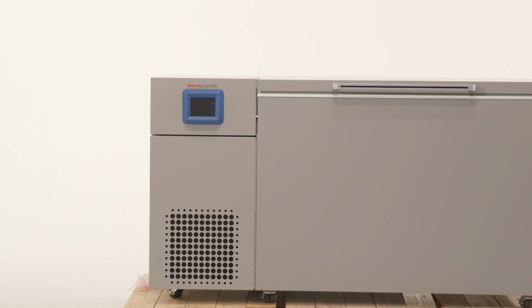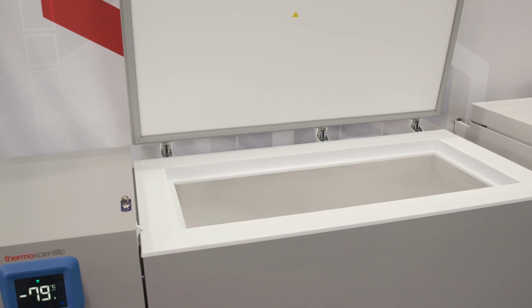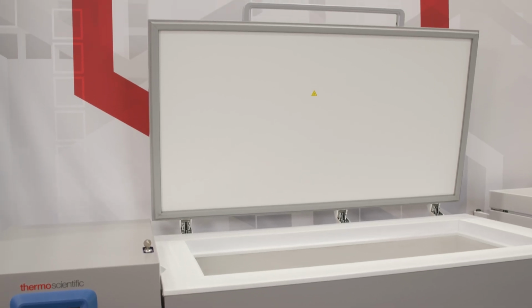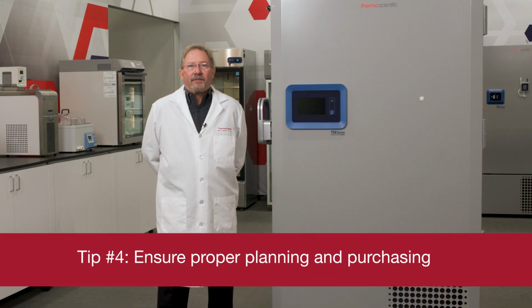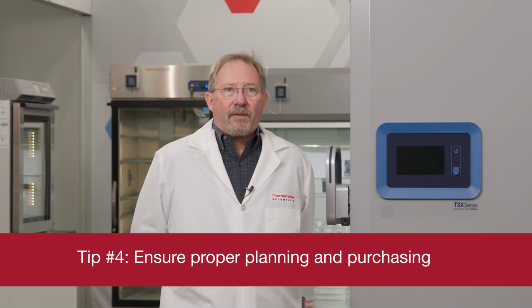One of the most common mistakes I've seen is planning for the size of the freezer. Will it fit through all of the doors from the loading dock to the laboratory? All of this information can be found on the technical data sheet. So what does all of this have to do with mapping? A lot. I would guess that the majority of the mapping issues regarding new freezers is that the wrong freezer was ordered and would not pass the qualification tests.